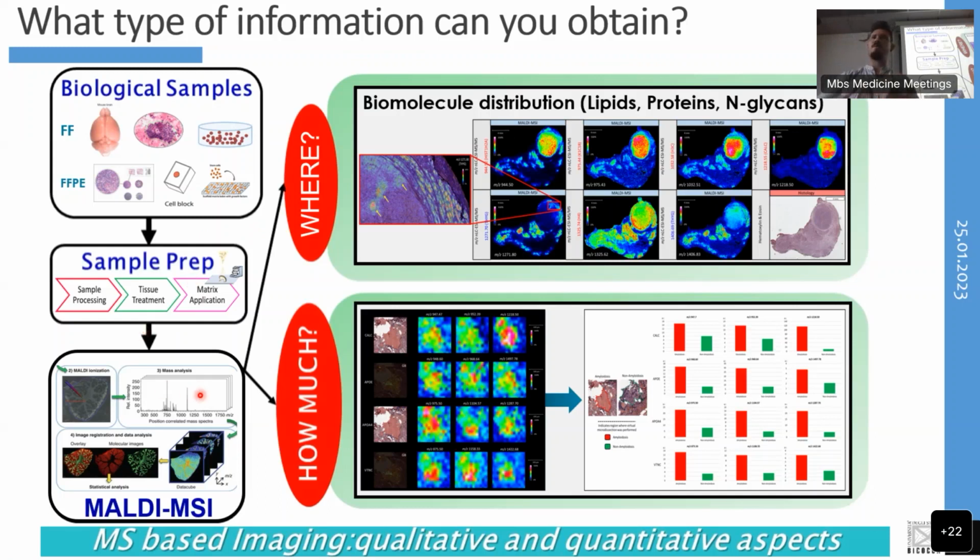And then, of course, we perform our MALDI image analysis, through which we generate these beautiful, highly colored images. And from these images, we're deriving effectively two key pieces of information. So where are our biological molecules? And we can actually overlay our molecular information with histological image post-analysis, because the technique isn't destructive. So we can overlay the two pieces of information together. So we know where the molecule is and from which particular cell type it's derived.